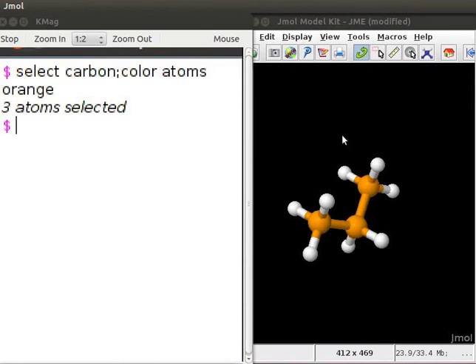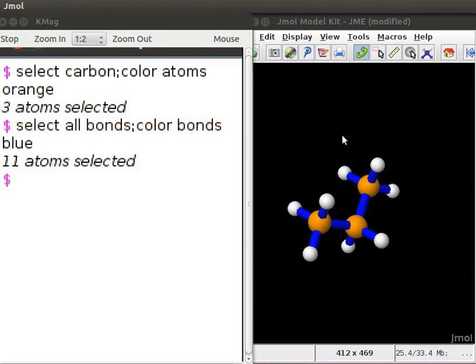Now, to change the color of all bonds to blue, at the dollar prompt, type select all bonds semicolon color bonds blue. Press Enter. Observe that all the bonds in the propane model are now blue in color.